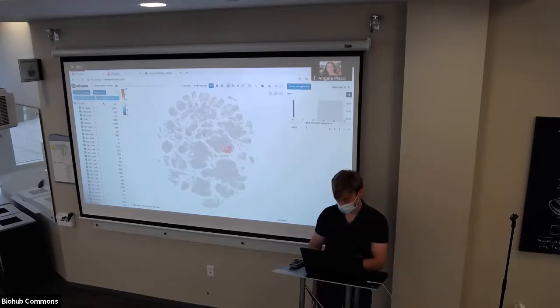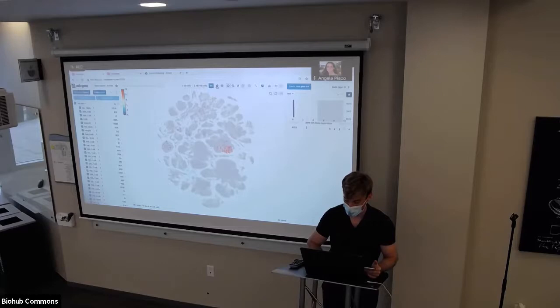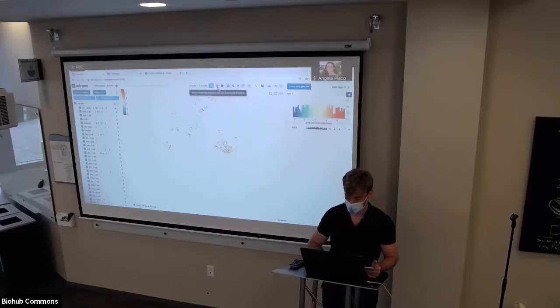Fantastic suggestion. One thing that you can try on that view is if you subset. Yes, so you can try subsetting. This is a button I'm going to show you later on. And now the histograms in front of the cell types start to make sense. So you can quickly scroll through it and see which cell types have the most expression.